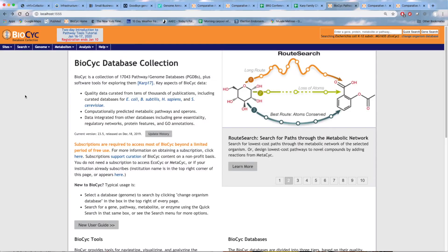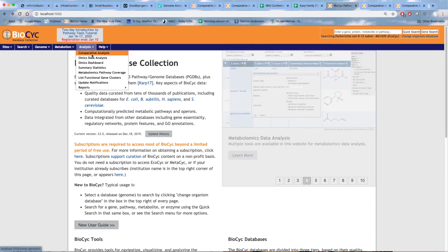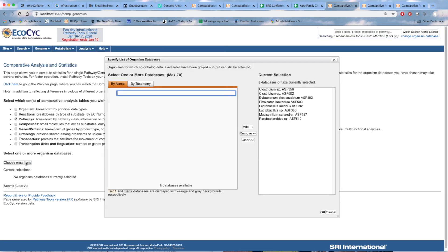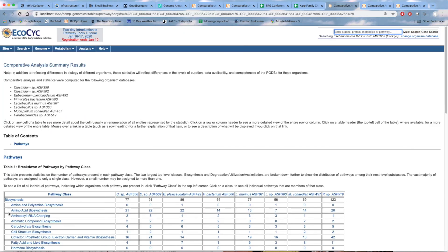The final tool we're going to look at is a comparative pathway analysis between all the organisms in this community. We invoke this — although this looks like the BioCyc website, this is our own local Pathway Tools web server. We're going to go under the comparative analysis menu, and we're going to select a pathway analysis. For the organisms, we have all of the eight altered Shadler flora organisms selected, and we're going to submit that query.